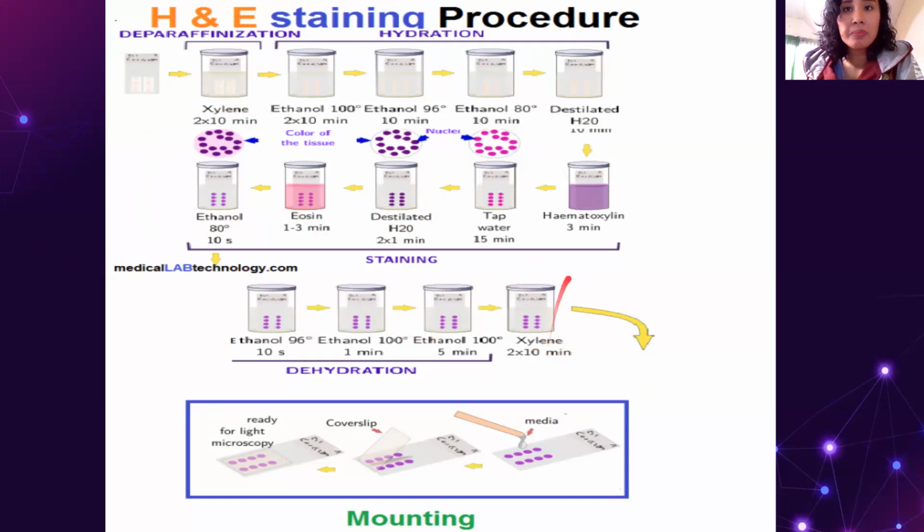Tapos clearing na naman, xylene. Then we will not allow it to dry out, okay? So lagyan mo na ng mounting media, lagyan mo na ng cover slip, and allow it to harden. Tapos pag natuyo na, it's ready for light microscopy.